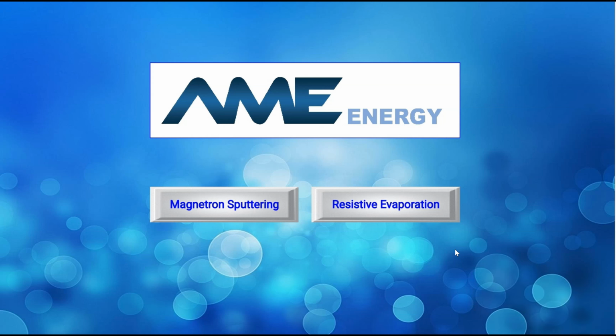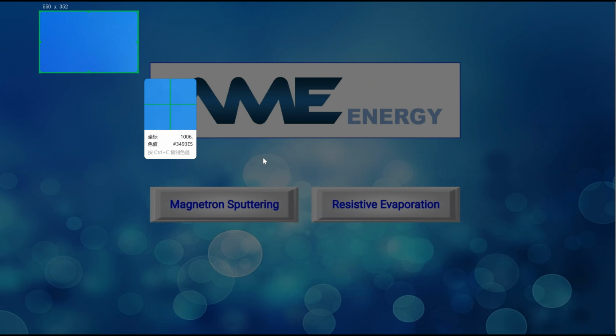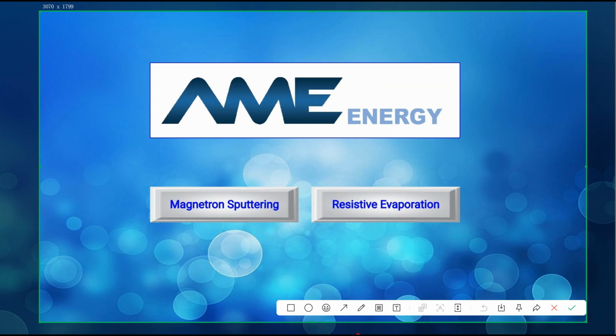Hello, this video is to explain how to operate the magnetron sputtering and the resistive evaporation machine. So we have a complete process for how to use this machine. Now about the physical operation.